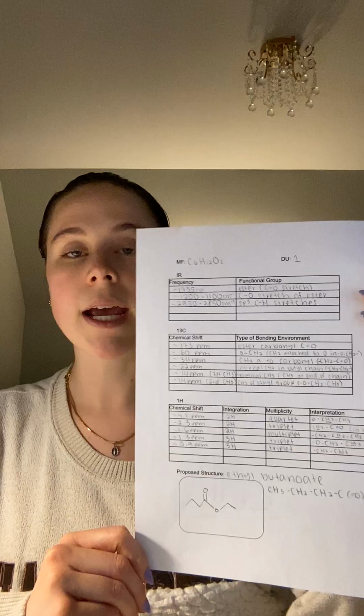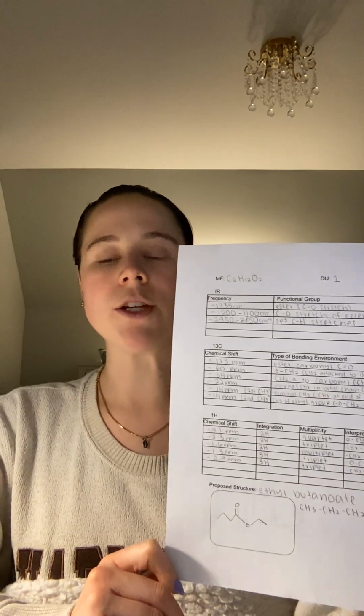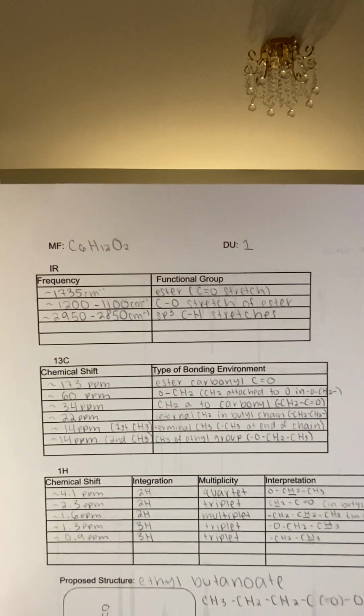It also has a DU of 1, which I calculated in the beginning. It matches my ester IR peaks, and with my 13C NMR table, it shows the pattern including an ester carbonyl and also an oxygen bonded to a CH2. And looking at my 1H NMR table, ethyl butanoate also matches 2 CH3 groups and 3 CH2 groups. So this is one final look at my paper. Thank you so much for your time.